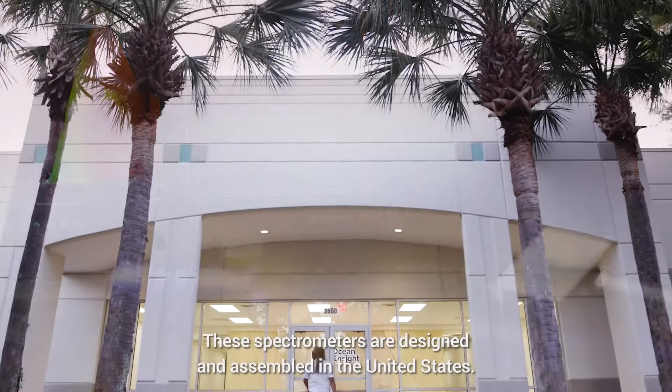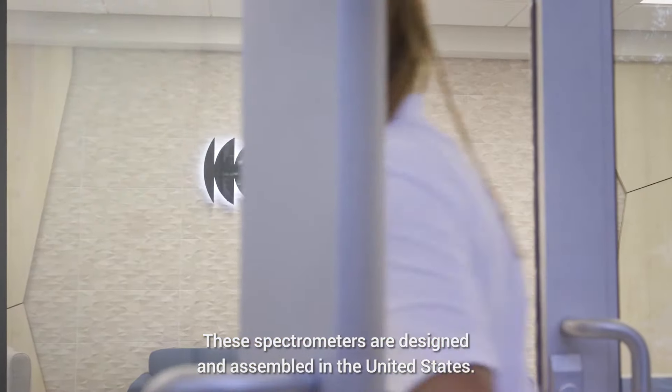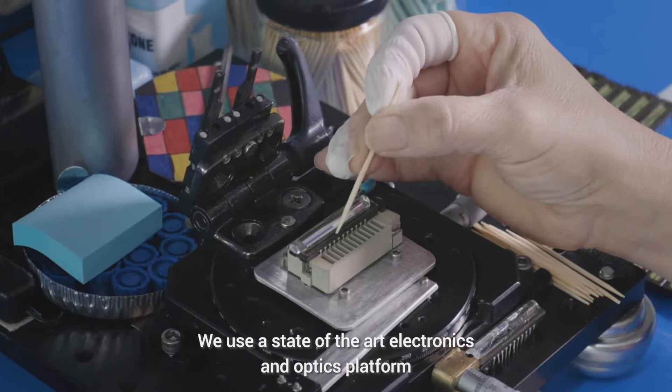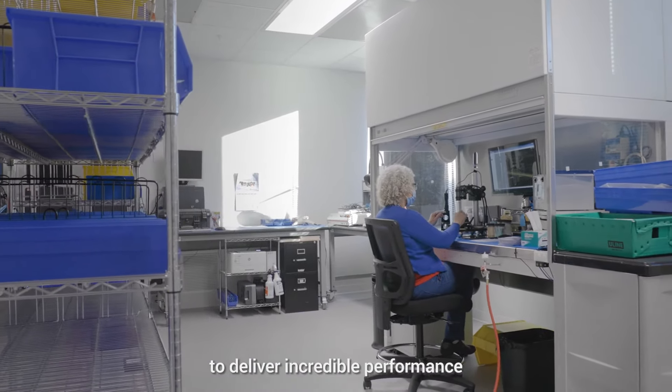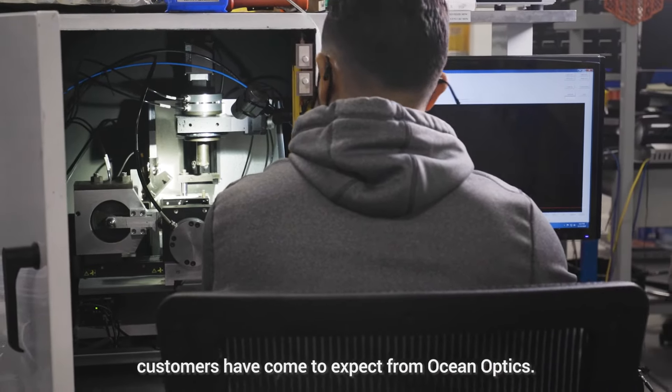These spectrometers are designed and assembled in the United States. We use a state-of-the-art electronics and optics platform to deliver incredible performance customers have come to expect from OceanOptics.